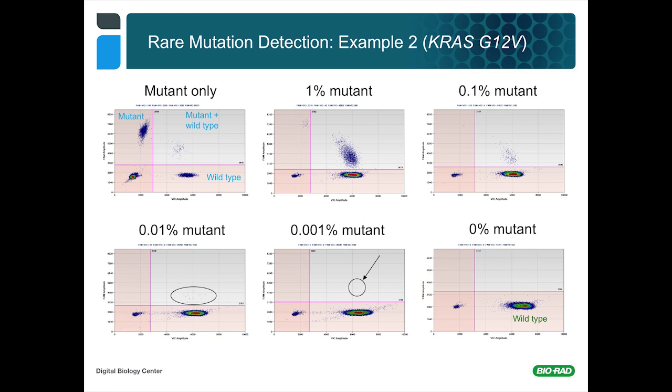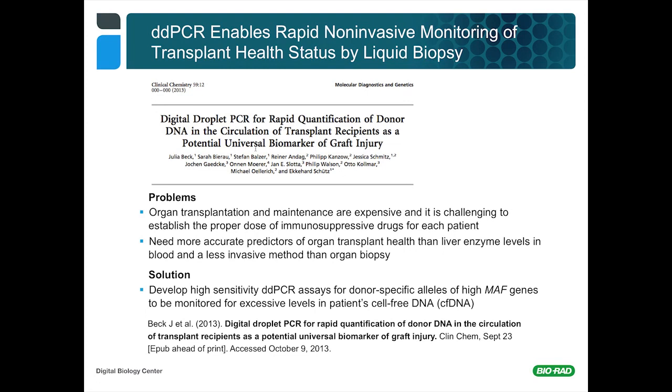I'm going to have to kind of speed through the last of this to make sure that we have time for your questions. So I'm just going to refer you to the fact that not only in cancer, but this is also being used now in transplantation monitoring of patients, which is a very expensive procedure, and which is very critical to assess the success of the transplant, to monitor the patients regularly.